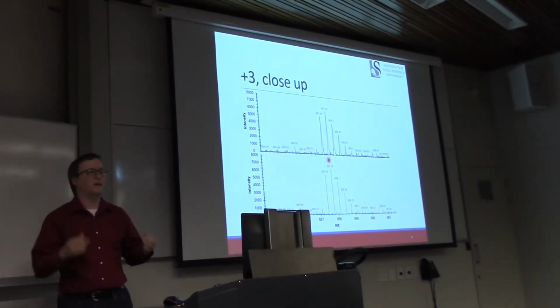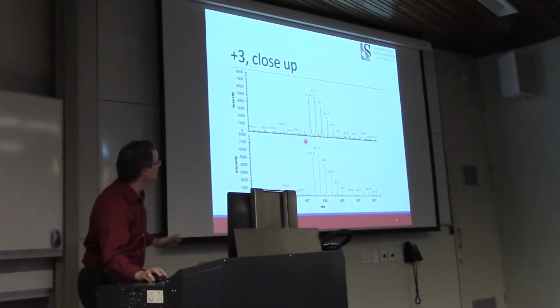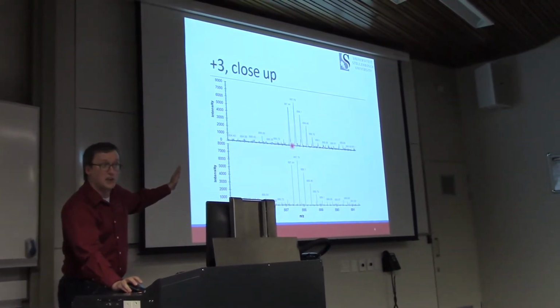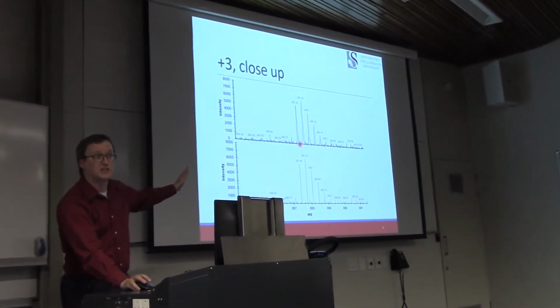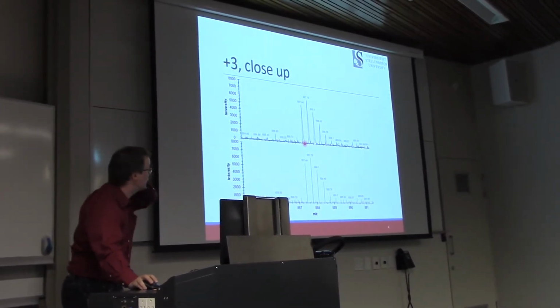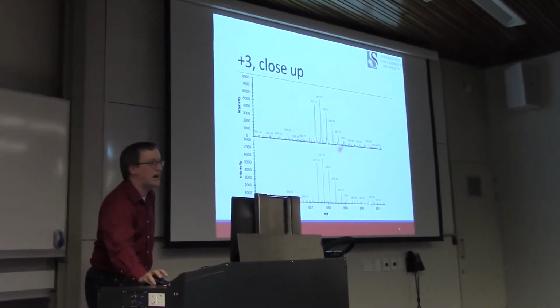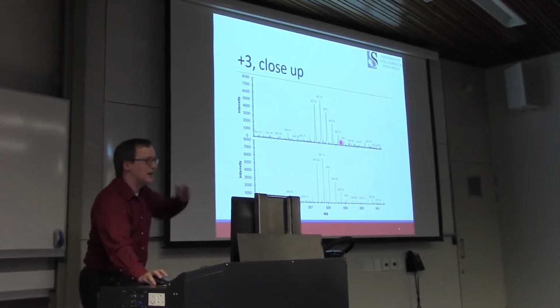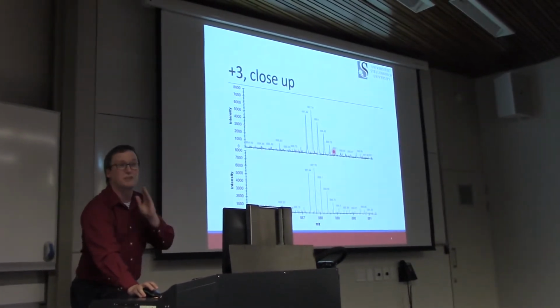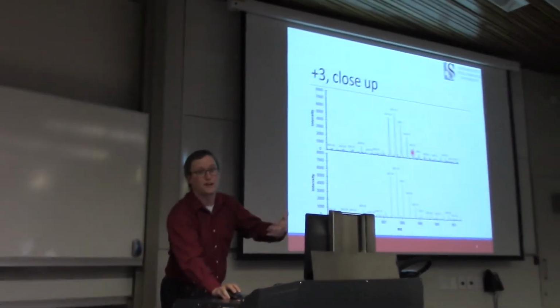Now, if we get up to a +20 ion, are we going to be able to baseline resolve the isotopes? Maybe not. So this is an example of high resolution, time of flight mass spectrometry. In the old days, TOFs were not particularly good at this challenge, but the peaks have gotten a lot narrower. The ability to resolve peaks has gotten quite good, actually. So what we have then is the problem of how we go from this up at the top, this collection of intensities as a profile as a function of m/z, and turning that into a bunch of sticks, because that's what we're going to have when we deal with it in the identification problem.